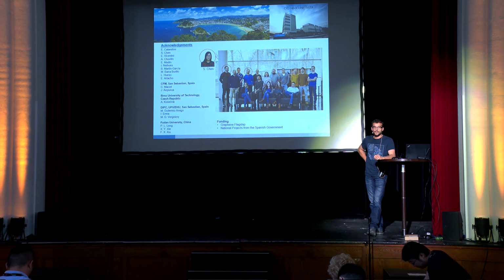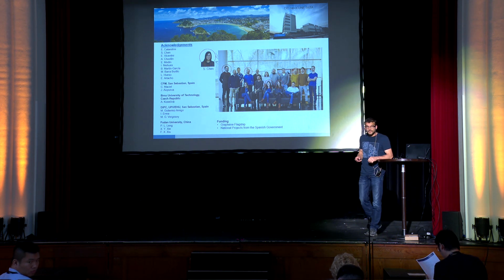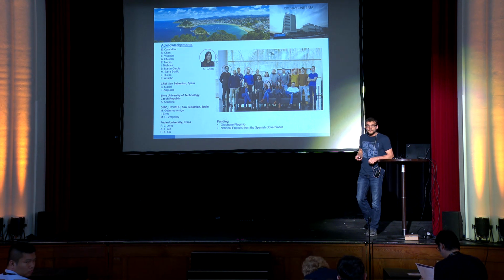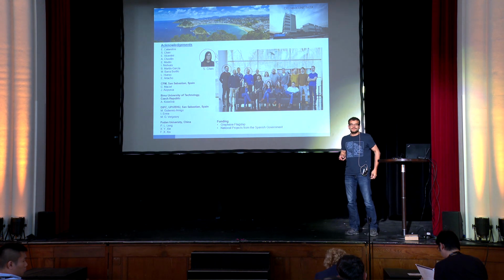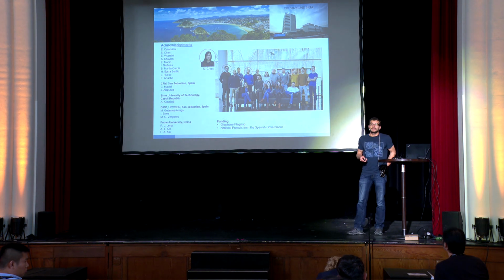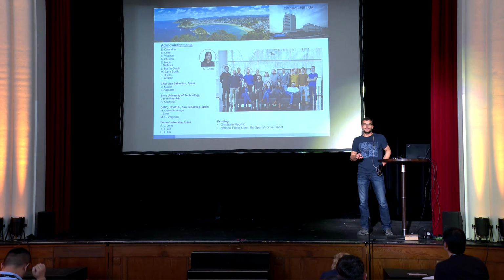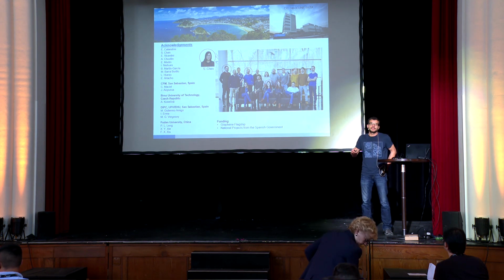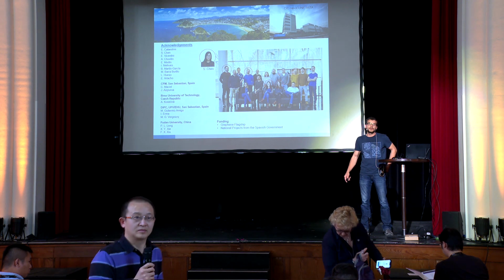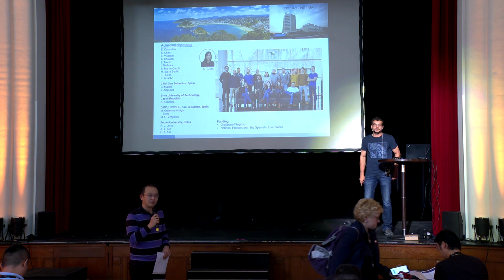Thanks, Rainer, for the great results and nice talk. I have a question about the hBN work. Was that on isotopically pure hBN? No, no, this was CVD grown. And can you potentially do that with CVD and then improve the results? Because you could feed it, right? That's a good question. We would need to ask Andrea Ferrari, but I think he's probably not here anymore. So I cannot tell you. But I guess not. I guess it's just a normal composition regarding isotopes. But that's what I suspect.